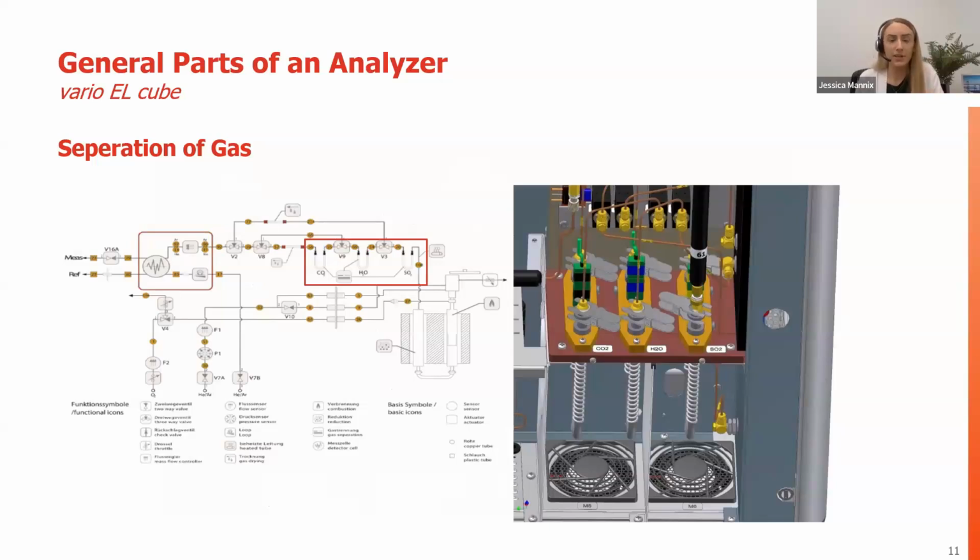Once the gas mixture enters the SO2 column, only the sulfur sticks on that, and the remaining sample gases move through. You can see the same for hydrogen. We analyze that as water and carbon as carbon dioxide. Again, nitrogen not being trapped, moving directly from that reduction tube over to the detector.